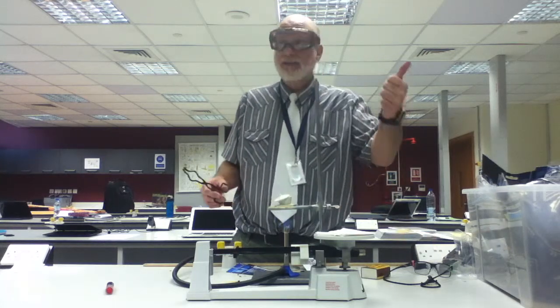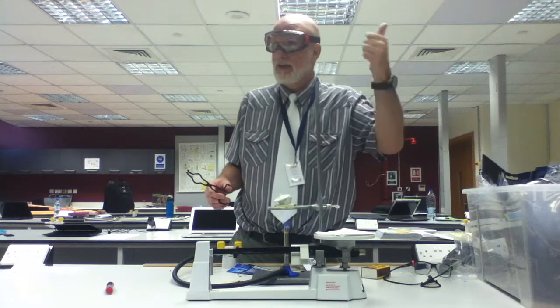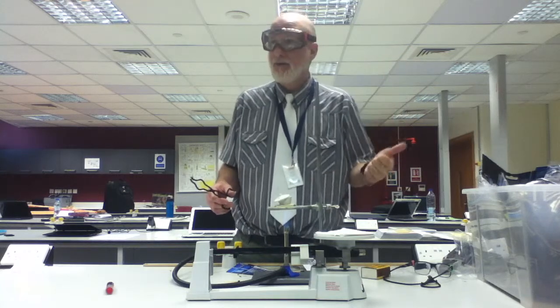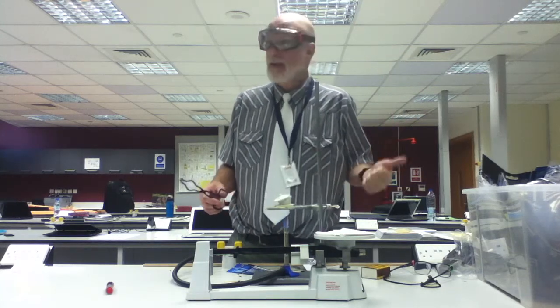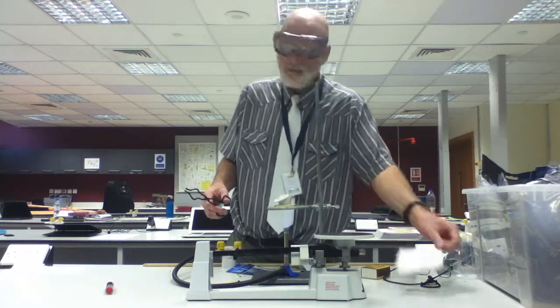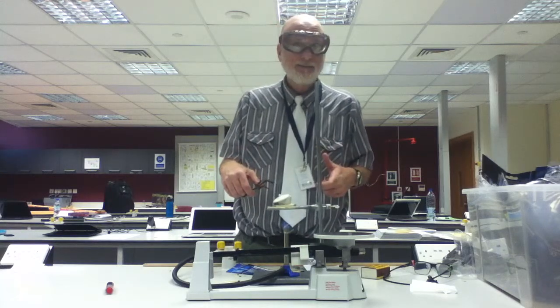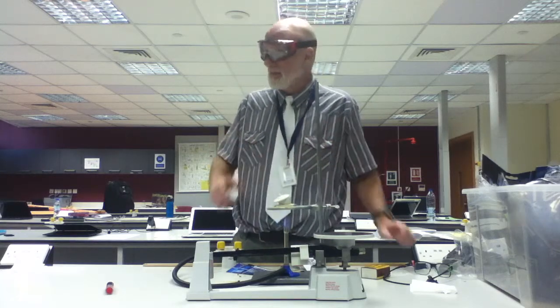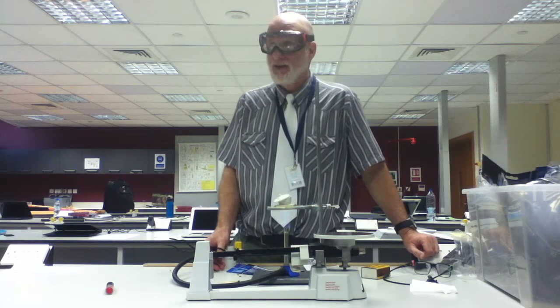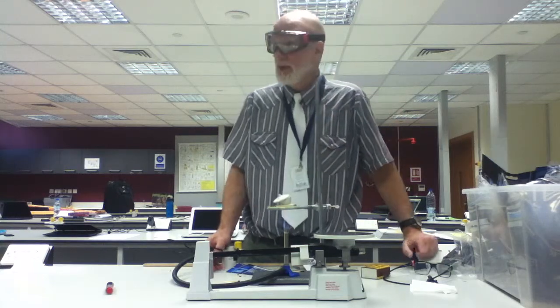I found the mass of the paper and the magnesium. Yes? So what can you find out now? The mass of what? The mass of the magnesium, correct? Can't you? Okay. You have to find the mass of the crucible and lid before you put the magnesium in there. Do you understand? Yes or no? Yeah. You have to find the mass of the crucible and lid before you put in the magnesium.